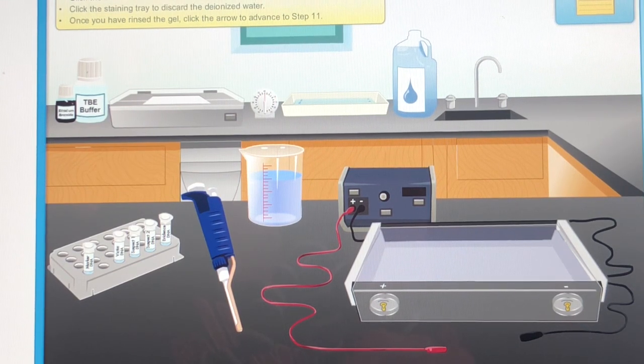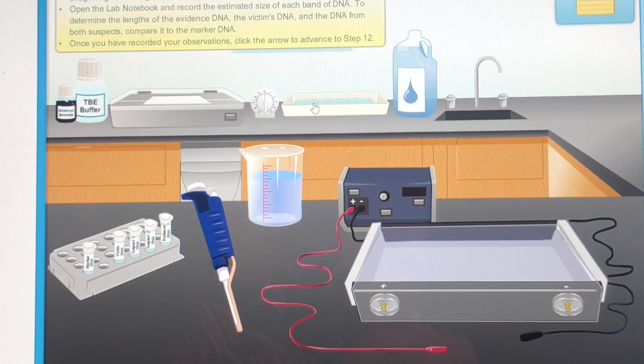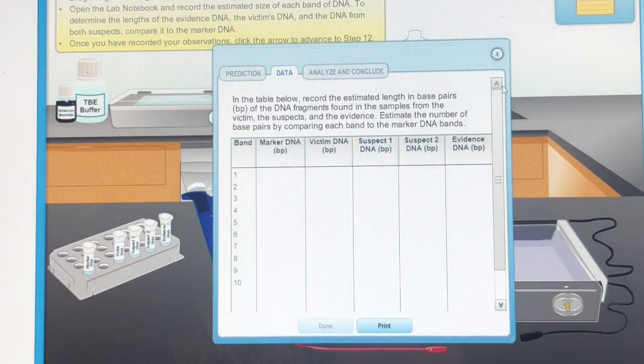Click the deionized water to rinse the gel and allow it to stand for 30 minutes. Click the staining tray to discard the deionized water. Once you have rinsed the gel, drag the gel to the light box and click on in order to read the gel. Open the lab notebook and record the estimated size of each band of DNA. To determine the length of the evidence DNA, the victim's DNA, and the DNA from both suspects, compare it to the marker DNA.